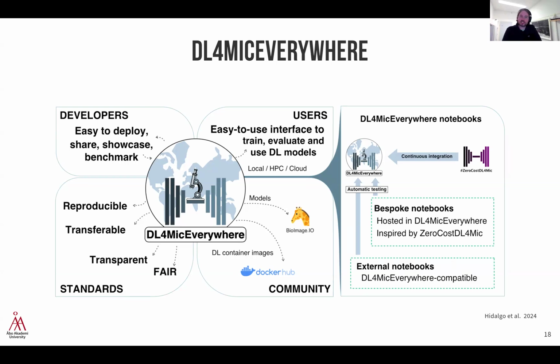And then there you get everything that is associated with it. So then it's fully reproducible and transferable, and it's also extremely private. So then you can do the analysis in whatever private setups that you have to try to address a lot of the issues that we've had with the zero-cost platform.